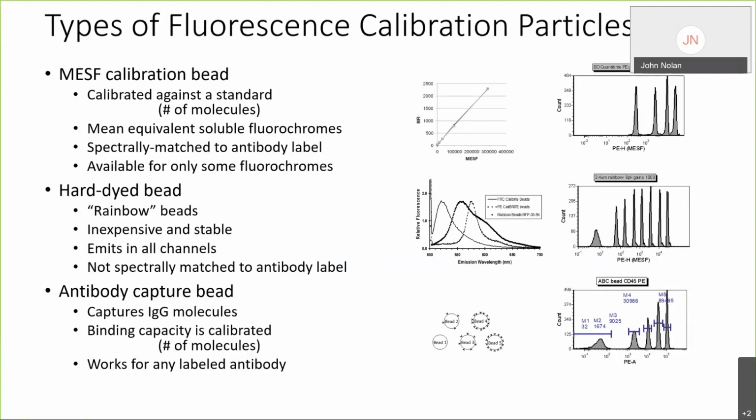This is really important. Report calibrated measurements. Many people use core facilities to access flow cytometers, and well-operated core facilities will provide these calibration beads and calibrated instruments for users.